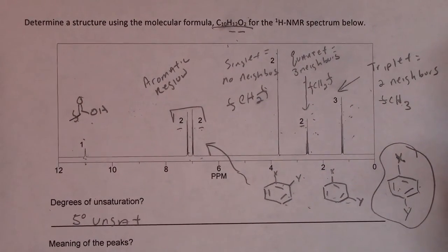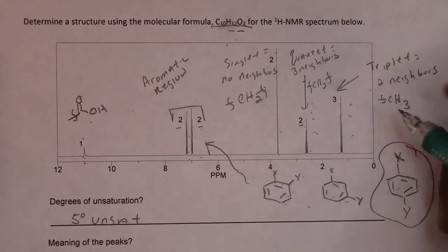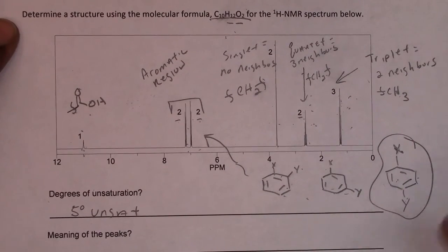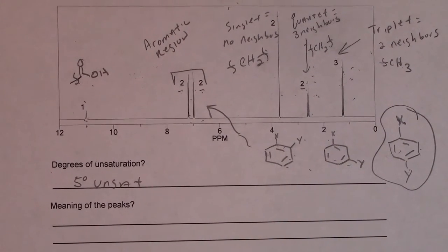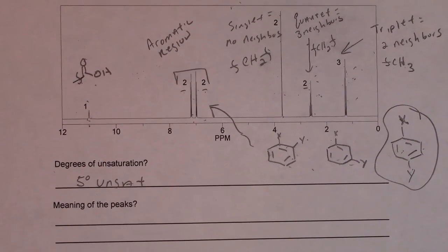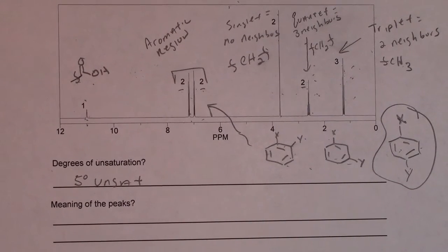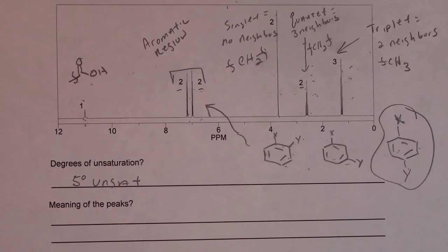So now the job for you is to put the structure together. Again, the goal here is to use all of the fragments that we have shown in this spectrum and piece this structure together the best way possible. So take a moment and see if you can piece this structure together. Push pause on your video, and then once you've found a reasonable structure and you've checked it with the splitting pattern, you're confident that you have got the right structure, then you can push play. But obviously, pushing play before is going to cheat you out of your ability to adequately solve these problems on your own.